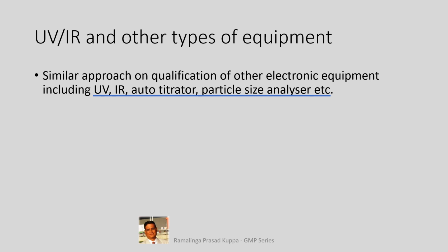Polystyrene film used should have a valid certificate. Thickness should be around 35 microns. The radiation pathways of IR should be clear and never opaque. Because of its nature, the grating and cells will be sensitive to the presence of moisture in the surrounding and may become opaque if not handled carefully. This should be the focus part of the qualification.